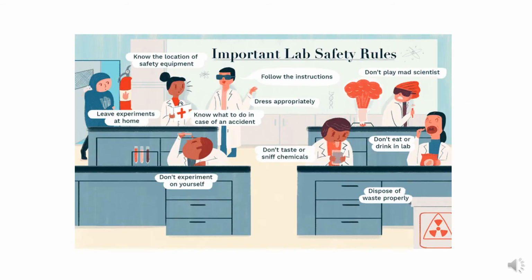These are, of course, important lab safety rules. Most of the things we already mentioned: to know the location of the safety equipment while you are working in the lab, and if you want to go home, don't leave your experiments running while you are gone.